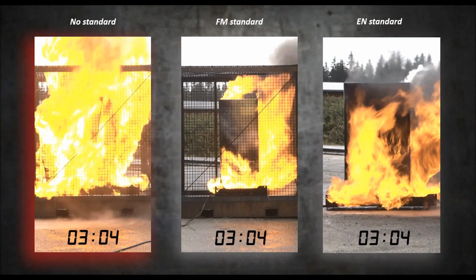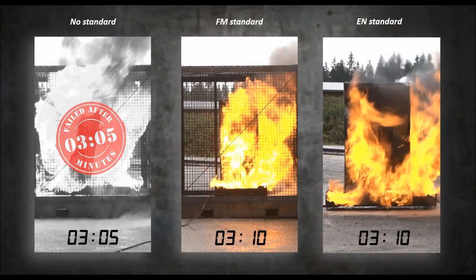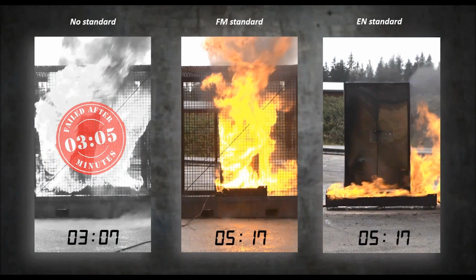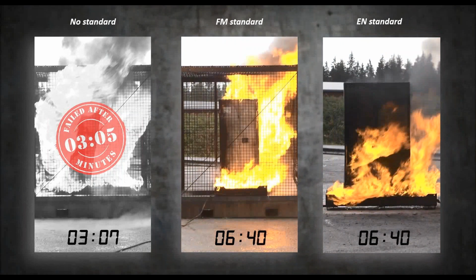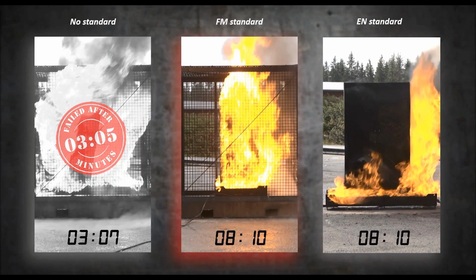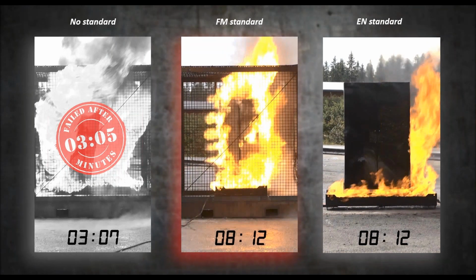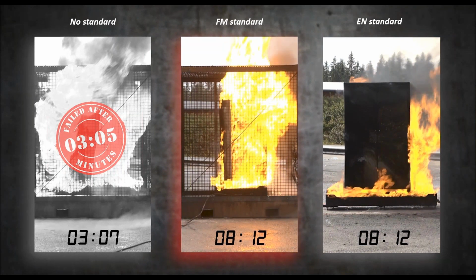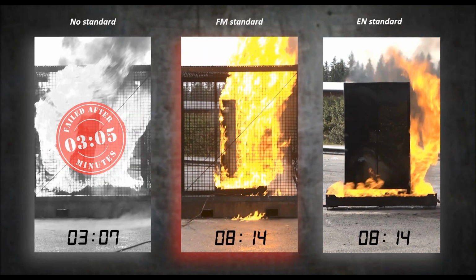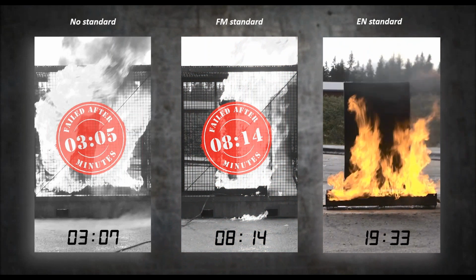Are they still out there? Unfortunately, there's still a bunch of them out there in the market. Then we'll move on to the FM or the ULC 1275 cabinet. Both are tested to relatively the same criteria. Of course, ULC, as I mentioned, is a little bit tougher, but it still has that 10-minute criteria. 3-point latching hinge, et cetera, and what happens when the fire resistance is done: doors blow open, chemicals come out. On the inside of these cabinets, there's about 1 liter of chemicals and then a 12-pack of aerosols. Not of Molson Ice, it's only noon, a 12-pack of aerosols.